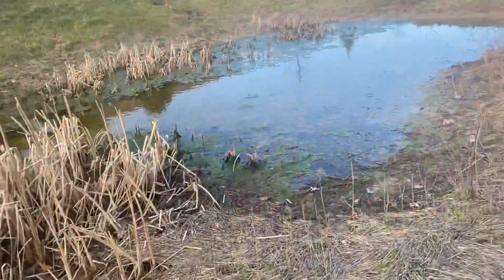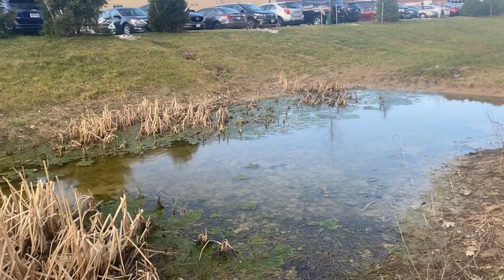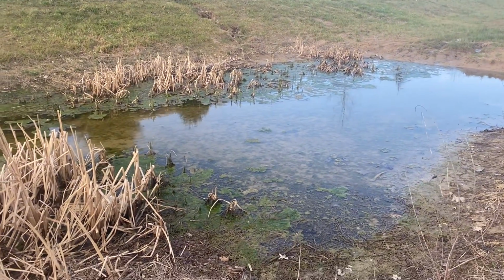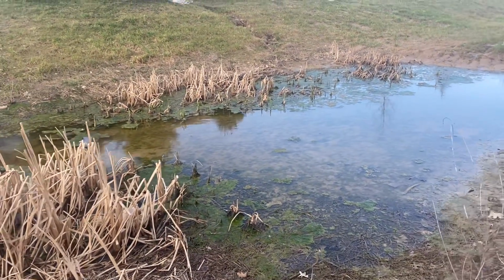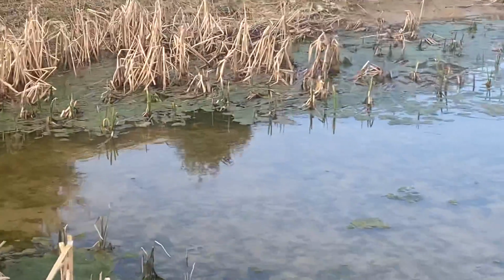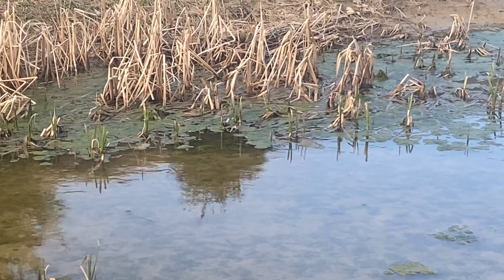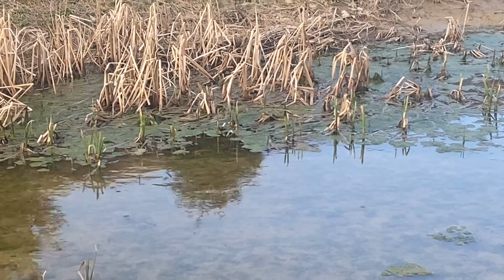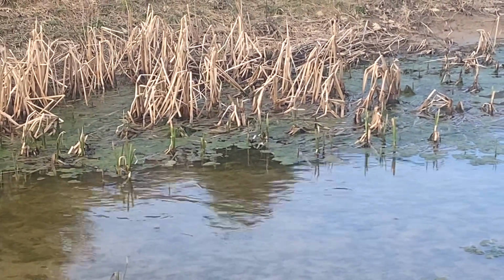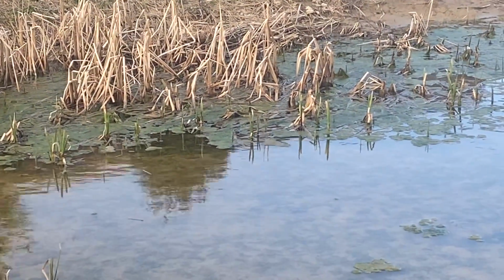And in addition to that, we'll be learning about biotic factors that help determine the quality of water. One of the reasons why we chose to test for these abiotic factors, specifically those nutrients, is because you can see the algae. There's algae here. So an indication of an algal bloom, like you can see, indicates that there may be some elevated levels of nitrate or phosphate. And so that's why we tested for that.